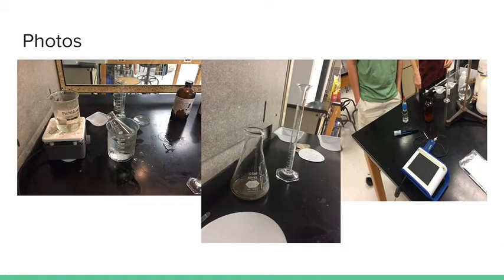Here are some photos of the lab we conducted. Here is trial 3 in an ice water bath. Here is a discarded trial that we actually believe boiled too long, and in one of the side reactions, a polymer is formed, and that could be burned.